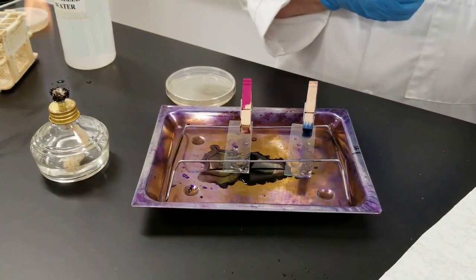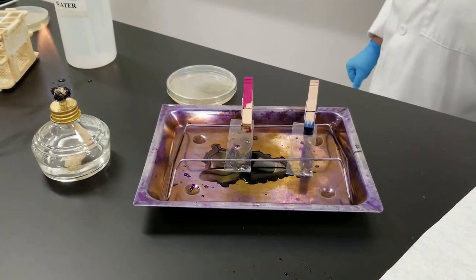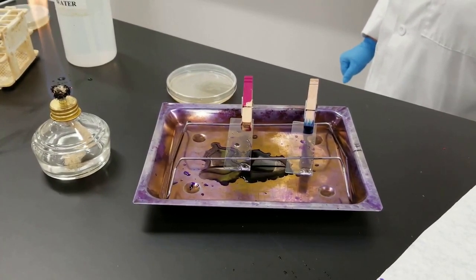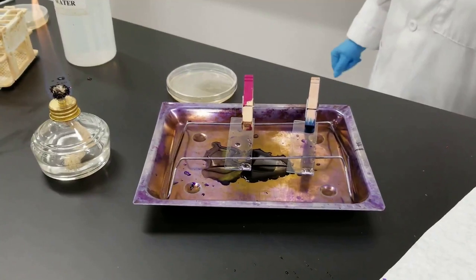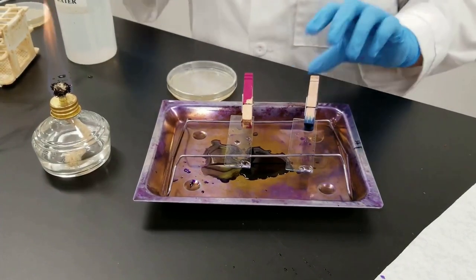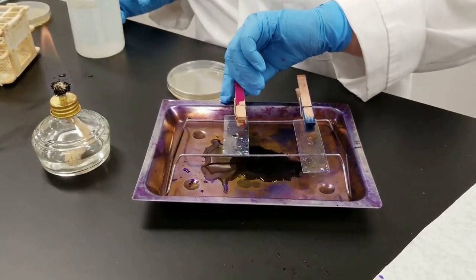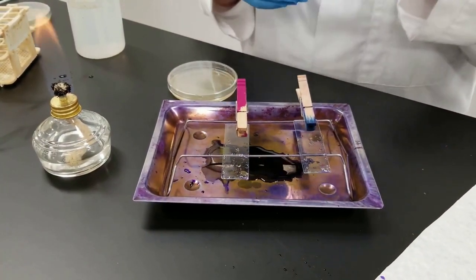This is a decolorization step. So the previous two steps, both organisms would have looked purple or blue if you looked at them under the scope. Once you add the decolorization step, what that is doing on gram negatives, because they have an outer membrane which is more lipid based, the alcohol is basically destroying that, ripping it off, and removing it. So 30 seconds, let's rinse. At this point, your gram negatives would be colorless, the gram positives would retain that purple or blue dye.